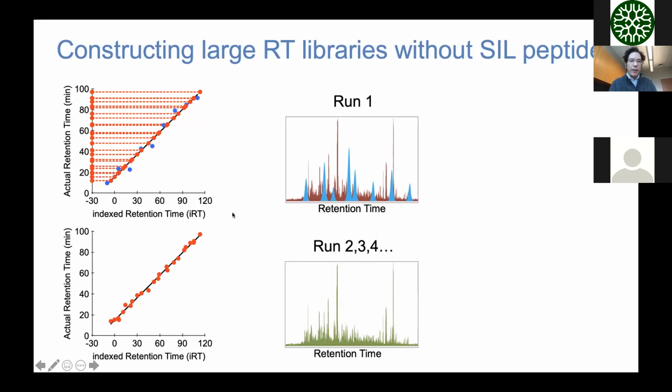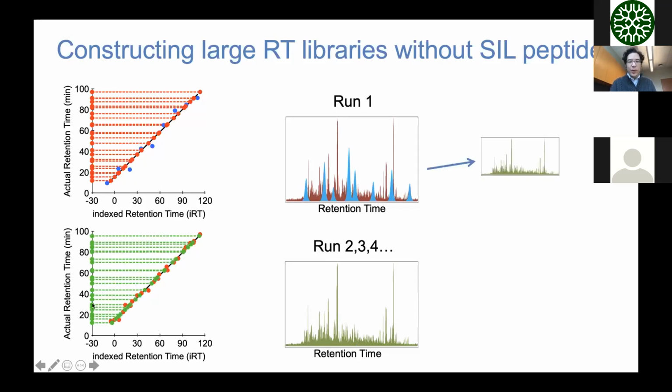If we take all those peptides in a totally different run that doesn't have stable isotope labeled peptides, we probably detected some of those that existed previously. Some of those peptides are going to be really common to experiments. Keratin, for example, is going to be in all of our experiments. Often, if you're analyzing serum, you might see albumin in all of your runs, no matter what you're looking at. You can use the albumin peptides in those cases to draw your line of interest. That would help you know where these particular peptides elute on this index retention time line, and you can take all of the new peptides that you see in another run and put them on that same line.